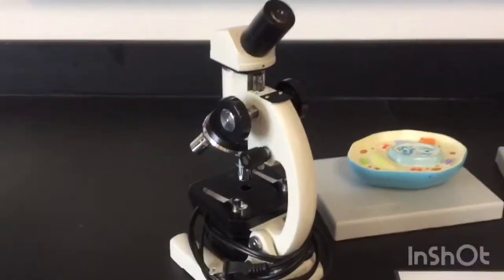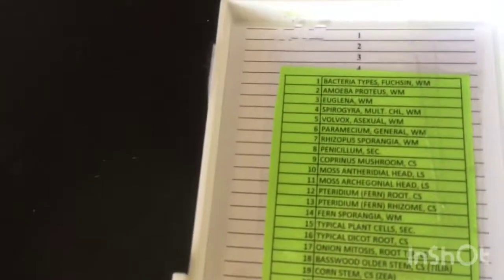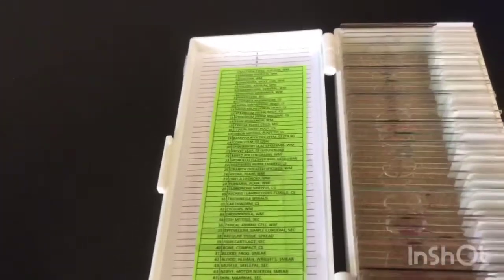Along with the microscopes themselves, we have several different slide sets. We have some human anatomy slide sets that were donated by the medical school. If you're looking more for cell biology, we actually have everything you can see on here. It's a 50 slide set. And there's some that will be directly related to cell biology, some that won't. So if you would rather, you can also just request certain slides. You don't have to get the entire set. Either way, that's available. And again, we would send enough so that each student could share with a partner.